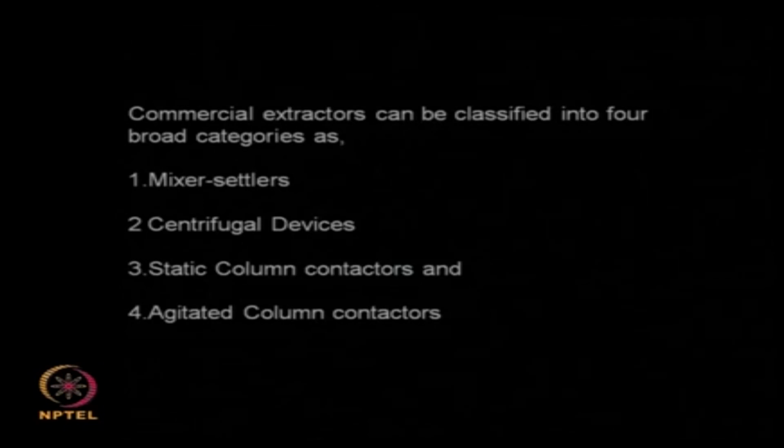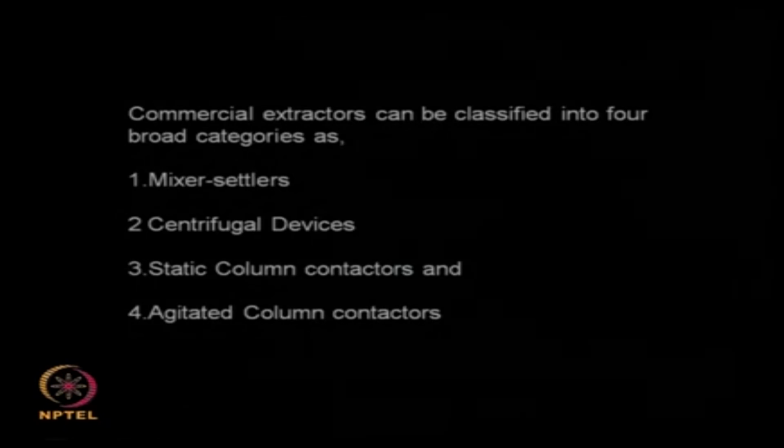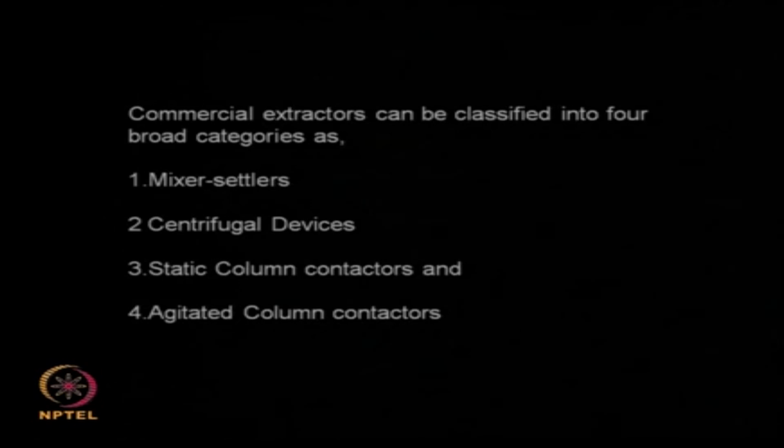So each one of them has its advantages and disadvantages, and one selects based on the requirements and the criteria of the separation. These are the 2 factors which one needs to consider, and as I mentioned at the very beginning, there are 2 important principles. One is thermodynamics.